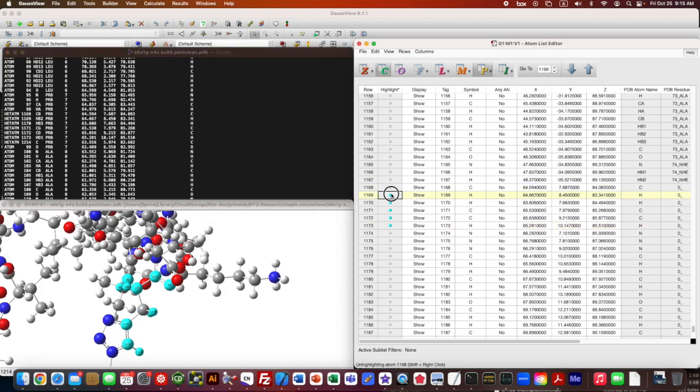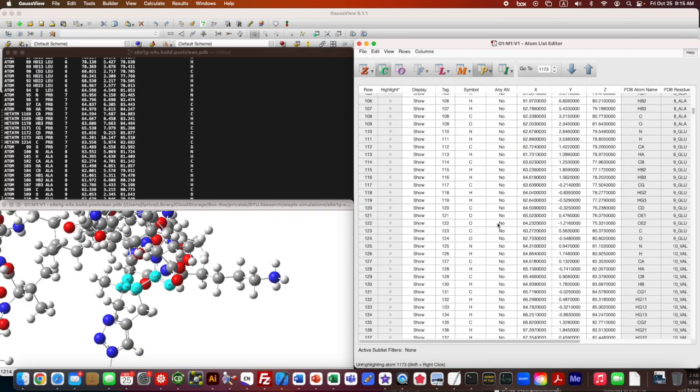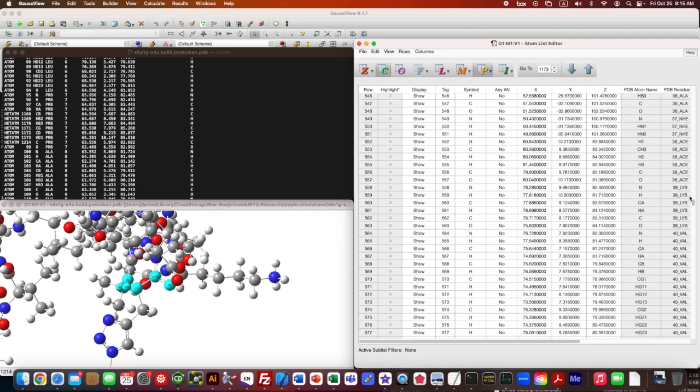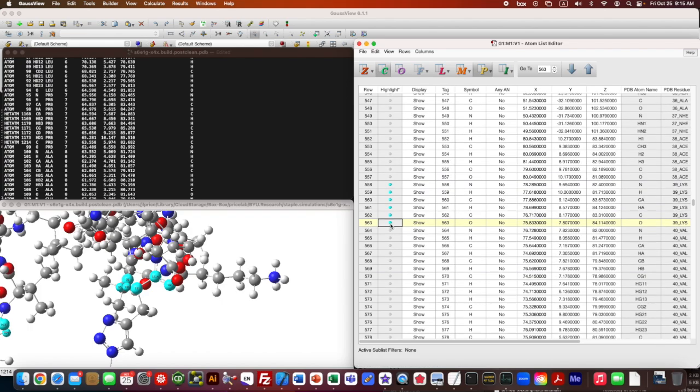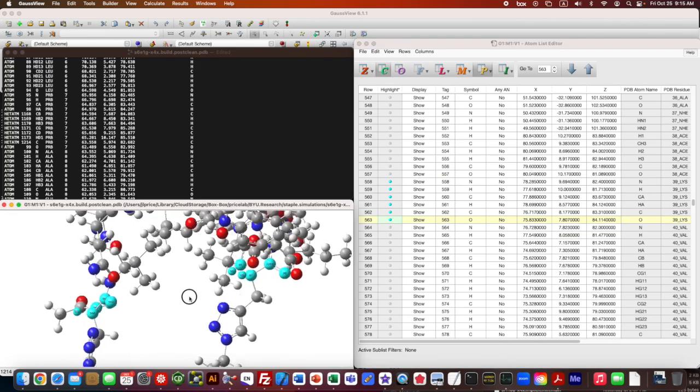Now I need to go find the next position where we made changes, which, yep, 39 is the first lysine residue, and you can tell because it's got the backbone atoms and nothing else. Conveniently, that one has the carbonyl carbon. We're going to have an extra carbonyl carbon that we've got to get in the right place, because I saw it next to the other one. It was the leucine, wasn't it? Yeah. All right, for now, we'll just center on these atoms.